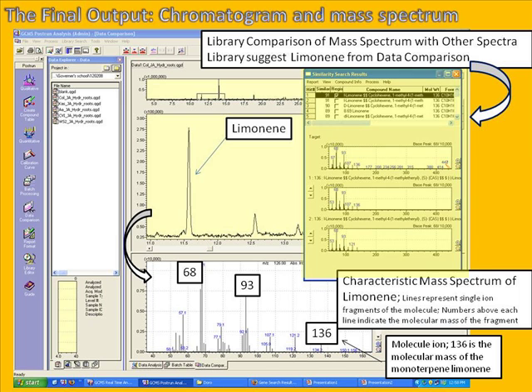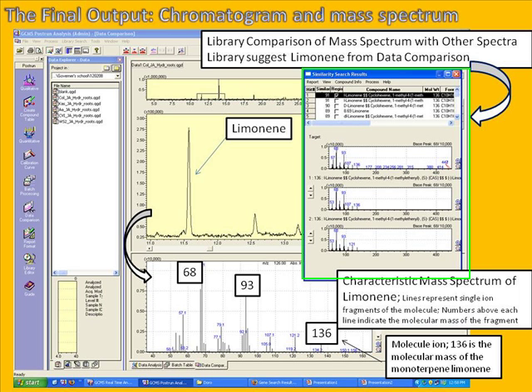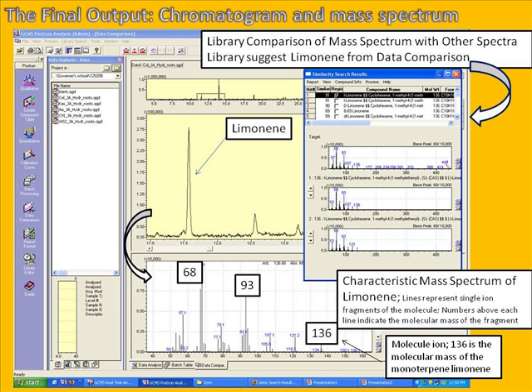The window on the right side shows a comparison of this mass spectrum from the chromatogram with others in a large database or library that have been collected. Based on the similarity search, the library suggests that this compound indeed is limonene. If you want to find out more about what limonene actually means, just Google it on the internet — maybe you will find something interesting with regard to this compound in plants and human applications.